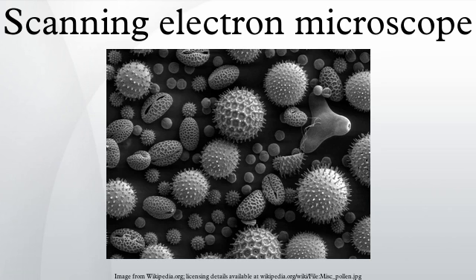In a similar method, secondary electron and backscattered electron detectors are superimposed and a color is assigned to each of the images captured by each detector, with an end result of a combined color image where colors are related to the density of the components. This method is known as density-dependent color SEM. Micrographs produced by DDC-SEM retain topographical information, which is better captured by the secondary electron detector, and combine it with the information about density, obtained by the backscattered electron detector. Some types of detectors used in SEM have analytical capabilities, and can provide several items of data at each pixel.